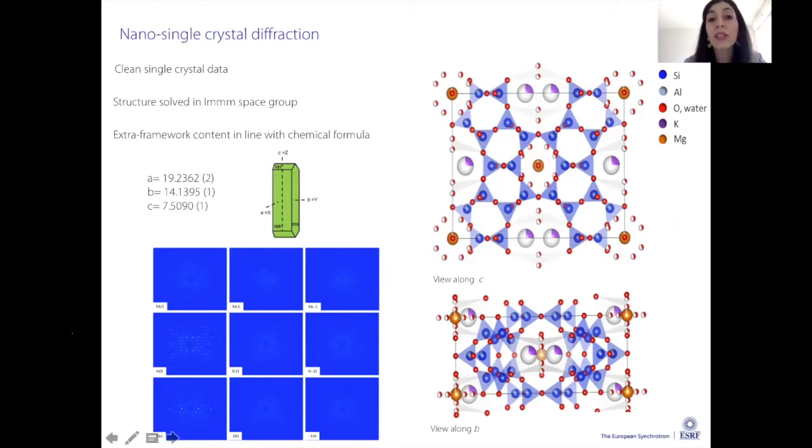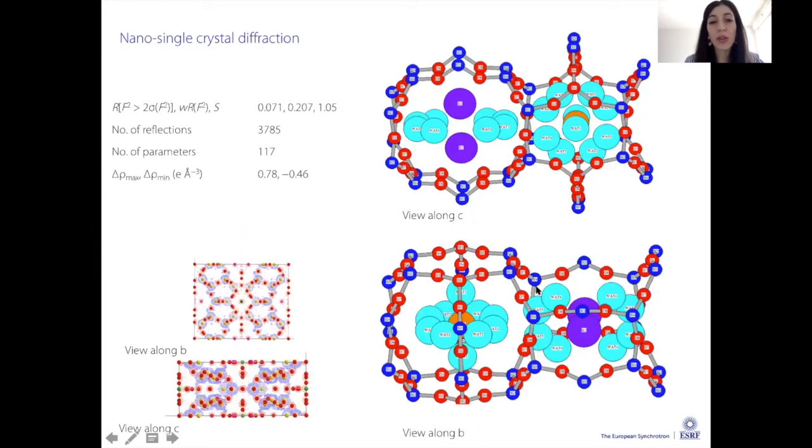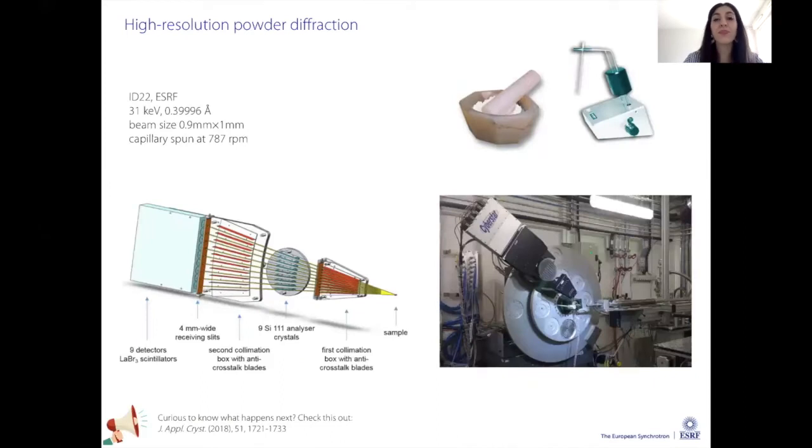By analyzing this data - indexing, extracting intensities, and eventually refining the structure - it turned out I had nice and clean single crystal data. I hope you can see here in these reciprocal space pictures that there are no extra peaks showing the symmetry is lower than Immm. I found extra framework content that was in line with the chemical formula. So basically I could have said okay, I solved my crystal, this is it, I'm happy, it's in line with my chemistry. Here you can see some other details of the refinement and the single crystal extra content.